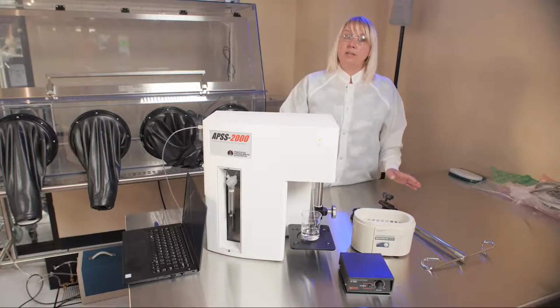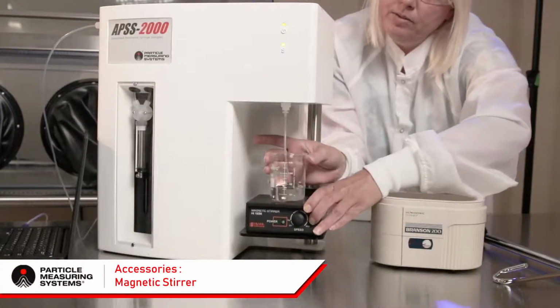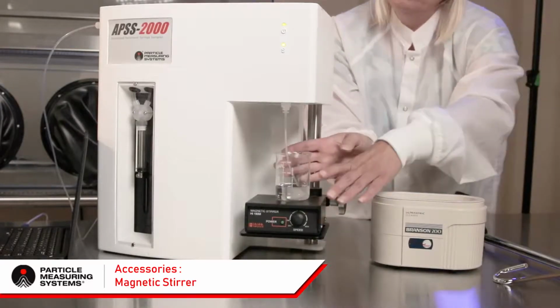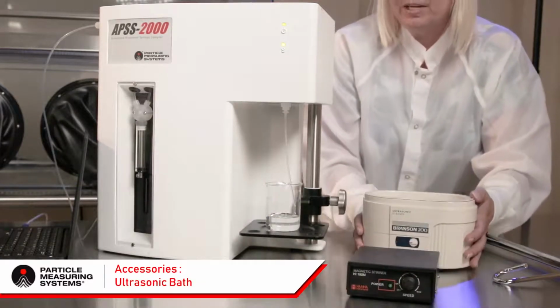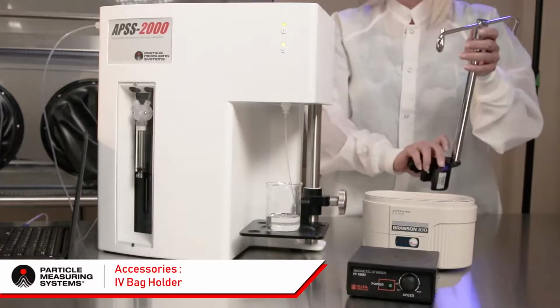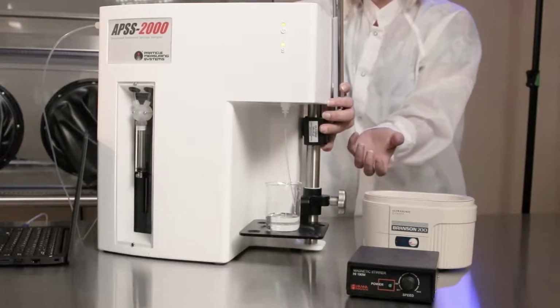The APSS 2000 has three different accessories. We have a magnetic stirrer. This is placed directly on the base, and this keeps the sample in motion for the entire process. We have an ultrasonic bath. This also keeps the sample in motion for the entire process. And then we have an IV bag holder. So if you have an IV bag, it hooks directly onto this holder and goes directly inside the instrument.